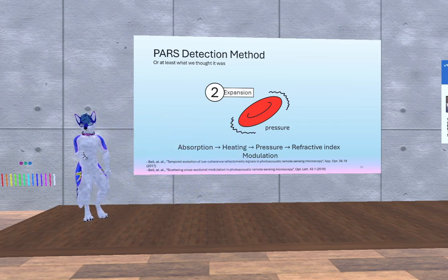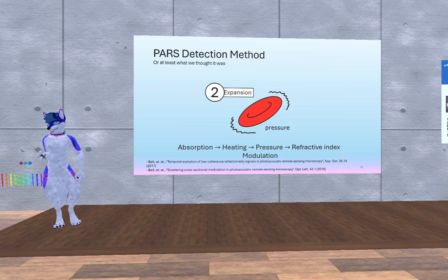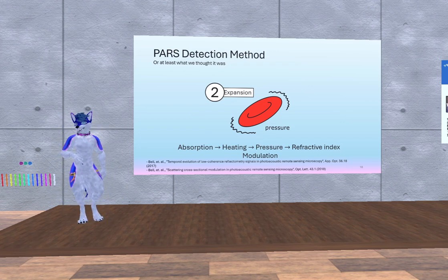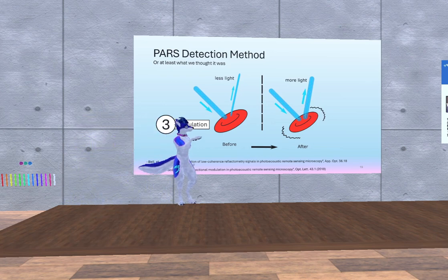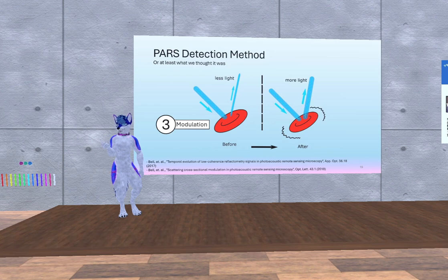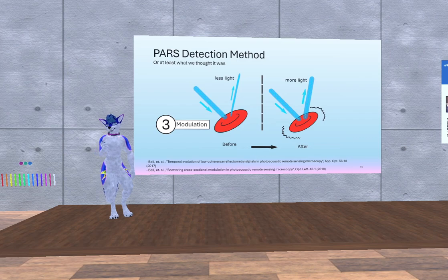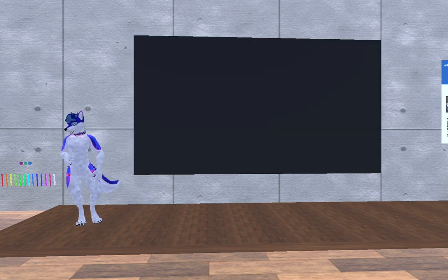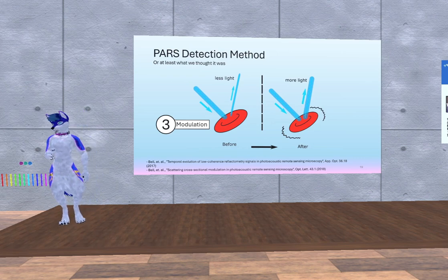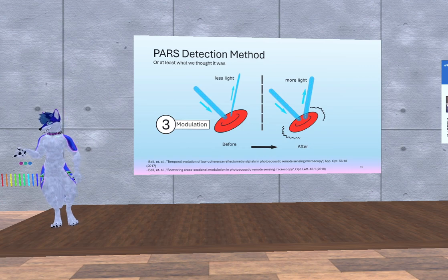So the refractive index of a material, which is effectively like the optical impedance of the material, is generally based off of the density of the material, right? So anything that alters the density even slightly can change the refractive index. And the cool thing, which might be another fun talk that'll be a lot heavier than this talk, is that a lot of my thesis work is on this detection. Essentially, because you have an optical interface, even if you have a very small modulation in the refractive index of one of those materials, you get a pretty huge amplification of the reflectivity off that interface. So even though you might only be changing that refractive index by like 0.002 or so, it's fairly detectable against the DC reflection that you're getting off the same area, as long as it's near an interface. It's really cool. If that sounds interesting, we could do another talk on that sometime. It'll be way heavier than this, though.